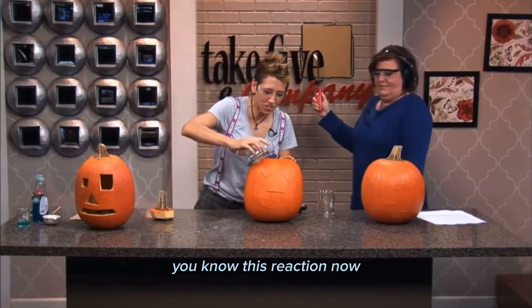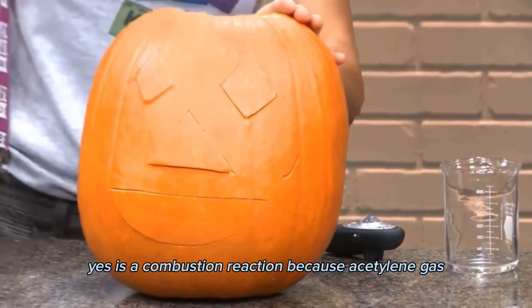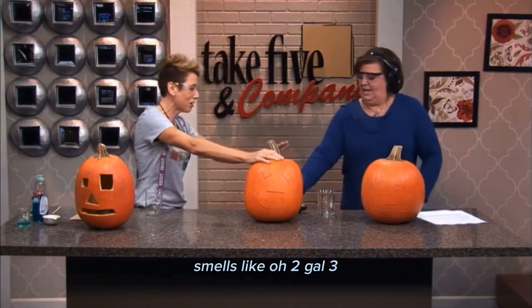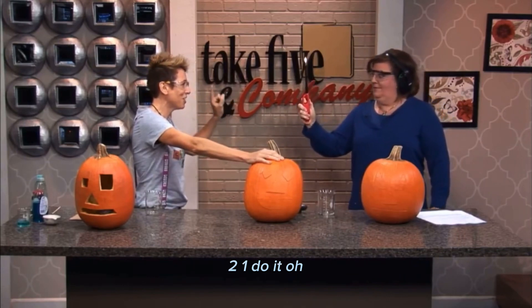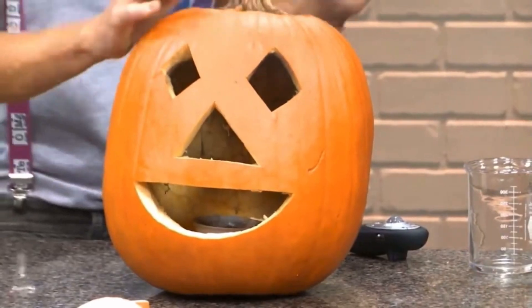That again — this reaction now taking place after the double replacement reaction is a combustion reaction because of acetylene gas. It smells like... Three, two, one. Do it! Oh! Poor little guy.